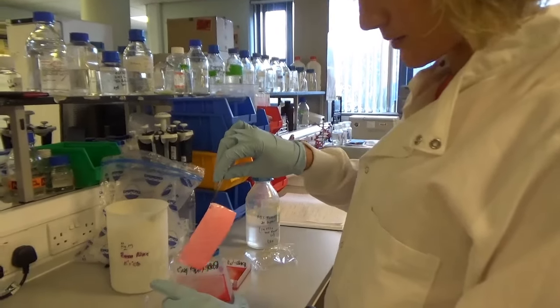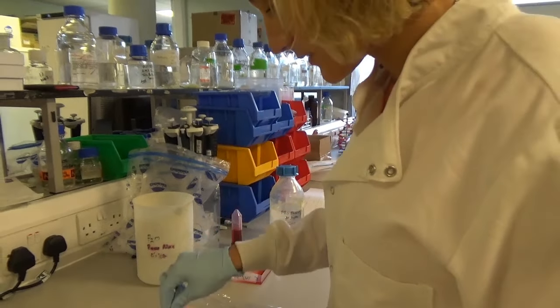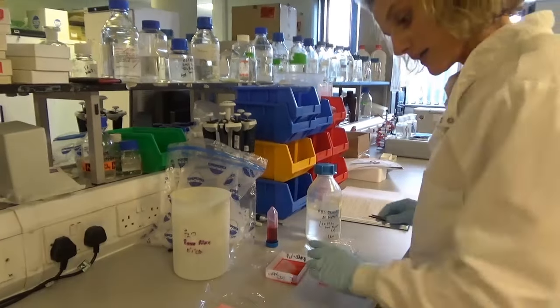But this is purely just to see whether I've managed to capture the protein on this bit of membrane, because if I haven't got it there, there's not much point in staining it for anything else.